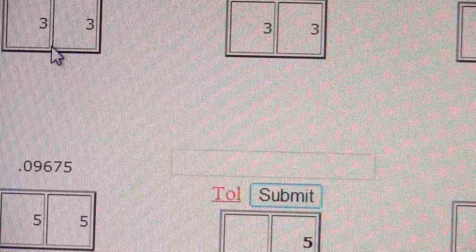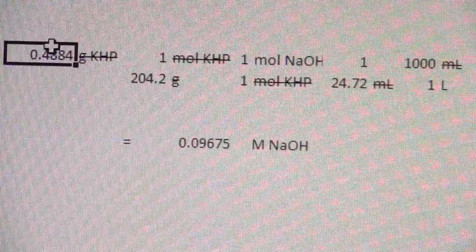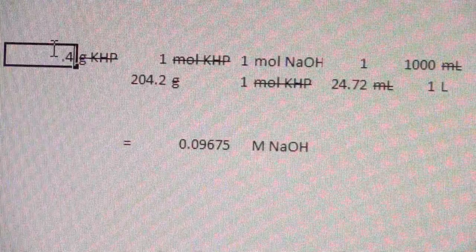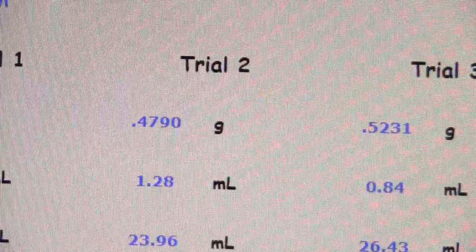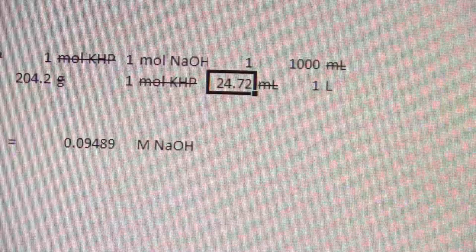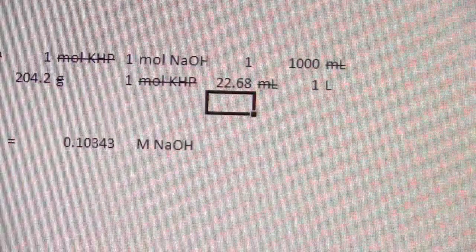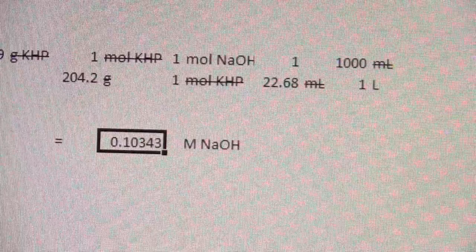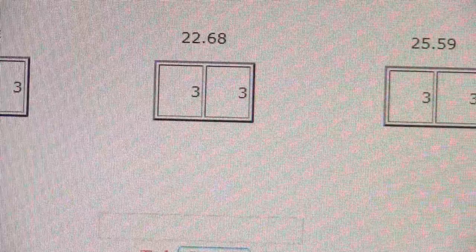Okay, now the nice thing about Excel is I can just put in my values, I can just adjust those. Point four seven nine zero, and that part is going to stay the same. And here I have 25.59, sorry, 22.68 is the second one.